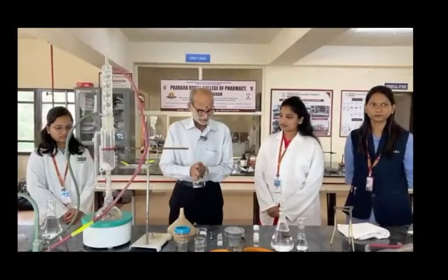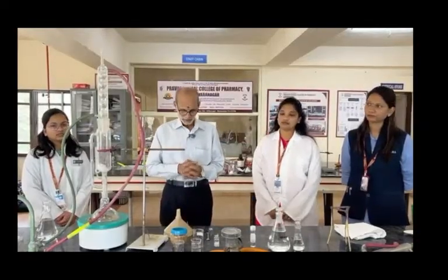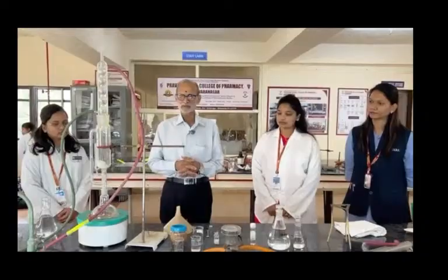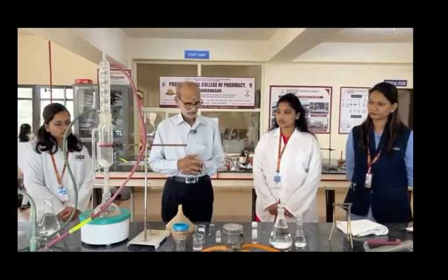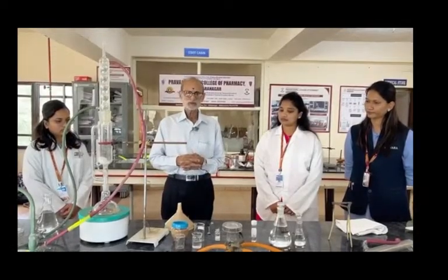Both lipid as well as embelin get extracted. We are going to start with the extraction and isolation of embelin. We took advantage of the property of embelin, which is a benzoquinone present in a plant called Embelia ribes, which is not soluble in petroleum ether. Embelia ribes and Embelia tsjeriam-cottam are the two species which are actually traded in the market, and the two contain around 1 to 2% of embelin.